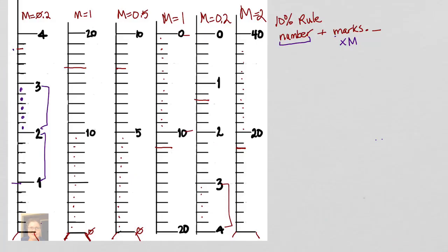When we fill a measuring device with a liquid, what we typically see is a curved surface at the top of the liquid. This is called a meniscus, and if we read this meniscus, the correct approach is to find the lowest point on that meniscus. And so in my measuring devices, this line that I've shown here in this dark red represents the lowest level of the meniscus that I'm reading. So I'm reading here. So let's make some measurements.